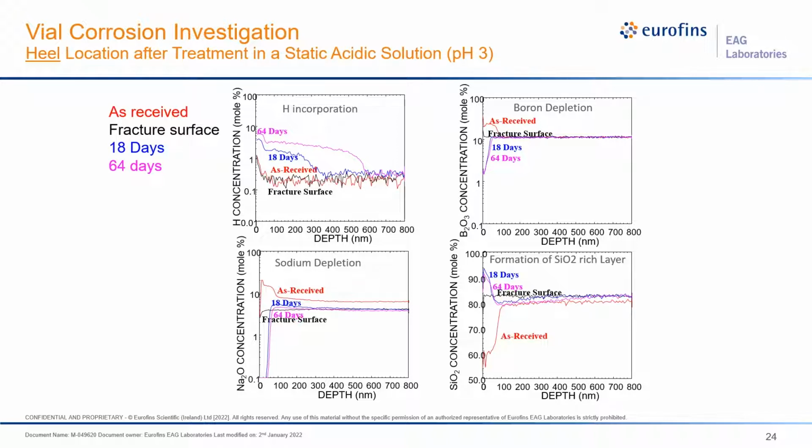And any further time exposed to the acidic solution really doesn't change the amount of depleted region or the sol-gel-like layer structure. So this perhaps helps us predict the flake size, or the formation of the sol-gel-like structures, by doing studies similar to this.